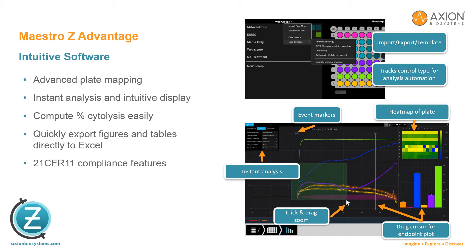The AXIS-Z software provides a straightforward approach to the setup, execution, and analysis of impedance experiments. Easily referenced color-coded plate maps provide all the information about the experiment and track control types for automation of the analysis. Assay setup is made easy with automatic acquisition and pre-configured settings for analysis. Impedance data are continuously displayed for each treatment group across the plate in real time, and to compare treatment groups at any time, simply drag the cursor over the plot.